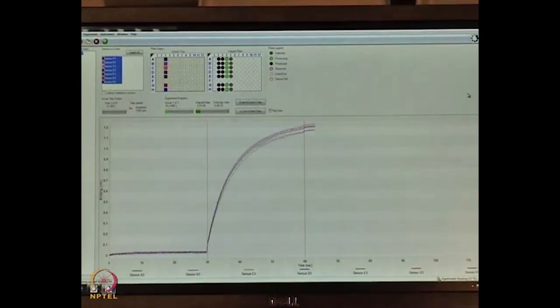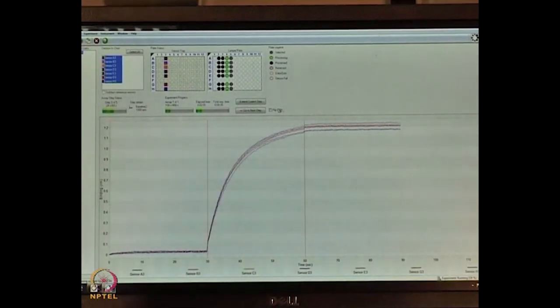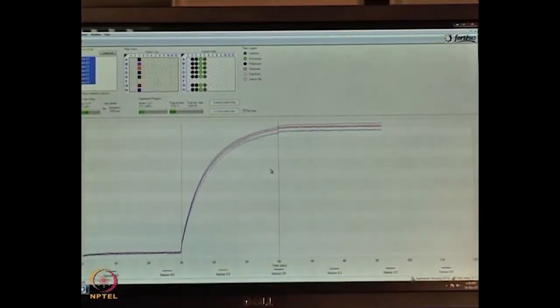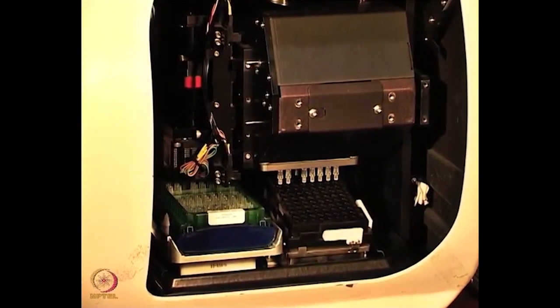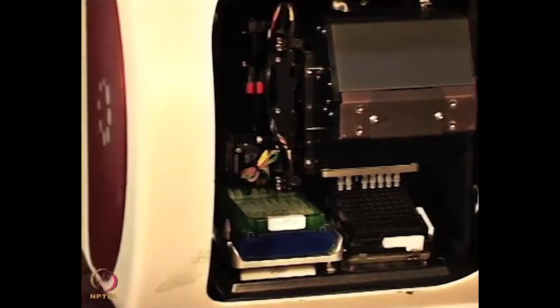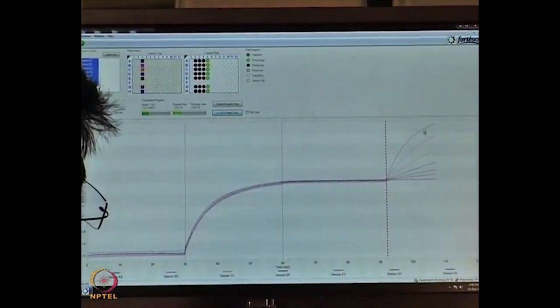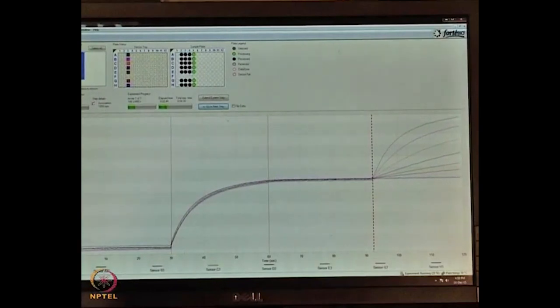We are acquiring for roughly 30 seconds; in less than 20 seconds we can see it reaching 1 nm — the binding is measured in nanometers. This is good enough loading for interaction studies. Moving to the next column with PBS buffer, unbound material gets washed off and the baseline stabilizes. Then the sensors move to the association step, where biotinylated protein A interacts with the mouse monoclonal antibody at two-fold different concentrations. You can see the curves — the highest concentration at top, then second, third, fourth fold dilutions, with zero concentration at the bottom.